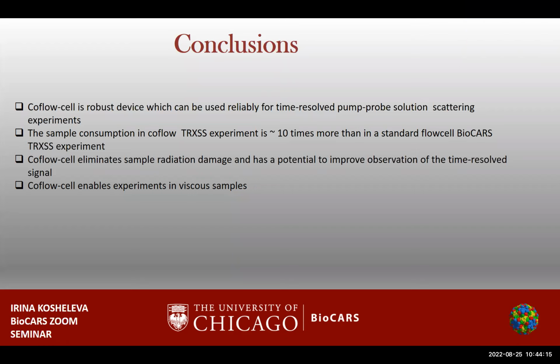But yes, I need to offset the laser beam. If it were a collinear geometry, that would be the vertical position of the laser. I place it on a motorized stage and basically interlocked it in the software. If it's in a horizontal direction, the laser stages will work well for that.